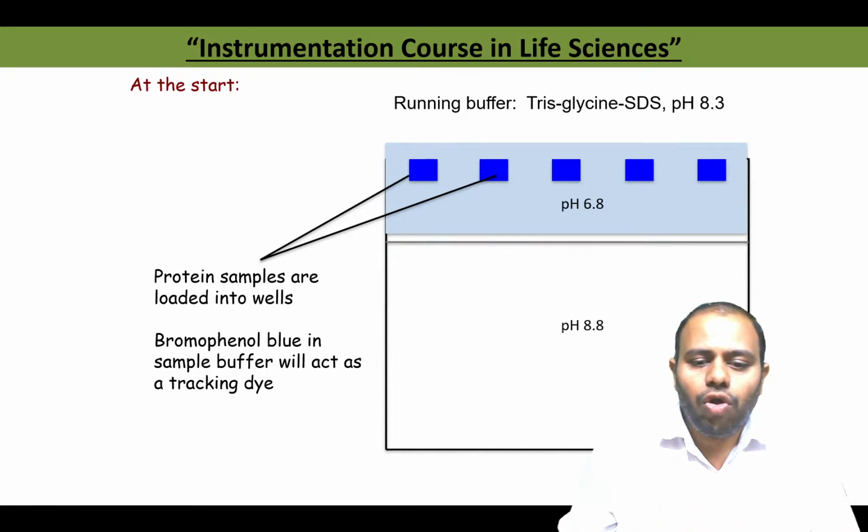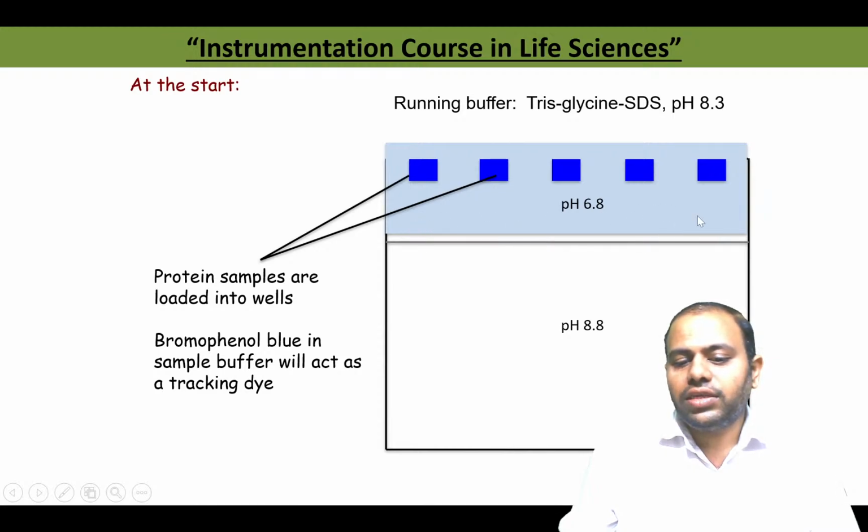Okay, so what is the role of stacking gel here? Whenever you load the protein samples in the well of the SDS gel, these proteins get stacked onto the stacking gel. Okay, and once it enters into the separating gel, it starts separating out.